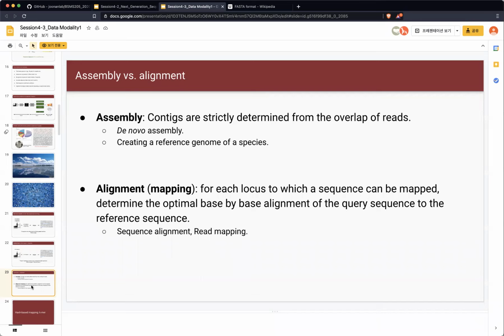Then you do the alignments, and you can tell whether the patient has the mutation or not, right? So you can predict which strain this person's virus belongs to, and which area. If you look at the newspapers or the media, they say this is the COVID-19 UK strain, or this is from India. A new strain outbreak from somewhere because of a gathering.